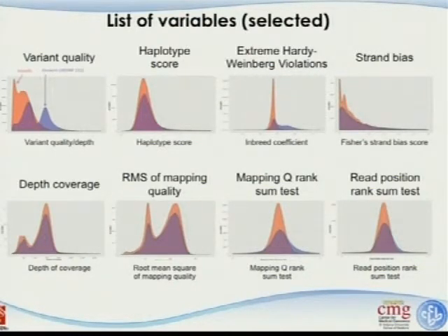For the ones that are not, it follows this shape. You can see the difference in variant quality, and clearly the variants that are already known have a little bit higher quality. But this is for each individual variant, and we can calculate this variant quality.